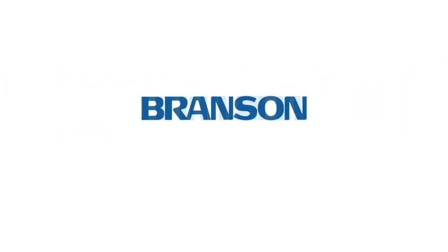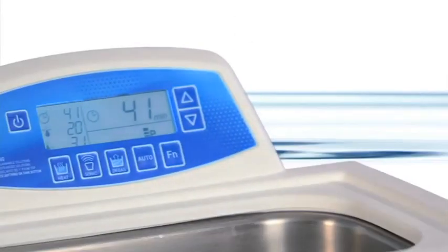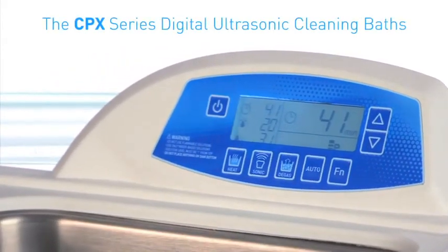For over 60 years, Branson has been a leading innovator of ultrasonic precision cleaning baths. Today, that tradition continues as we introduce a new line of digital ultrasonic cleaning baths, the CPX series.